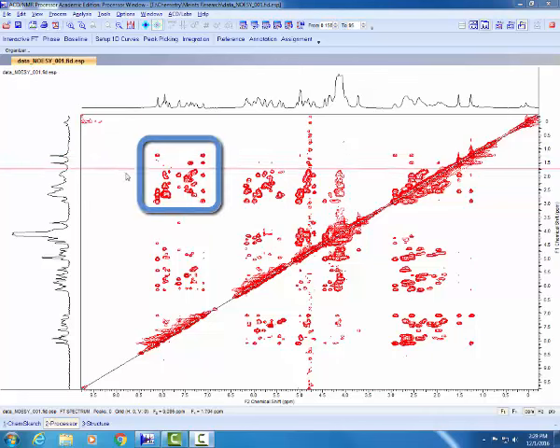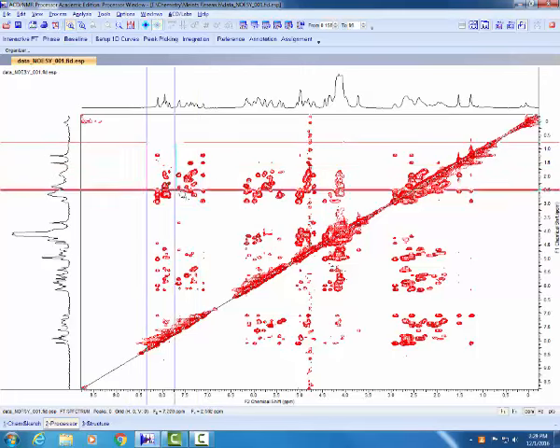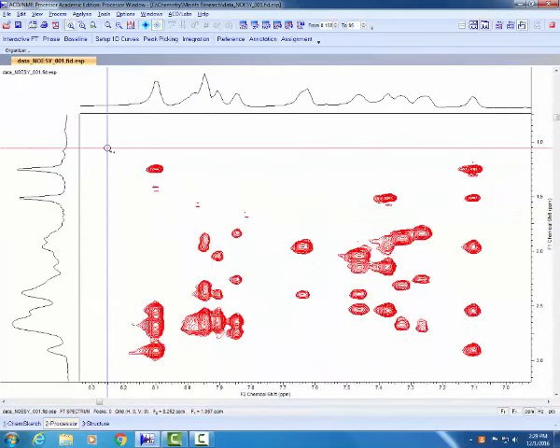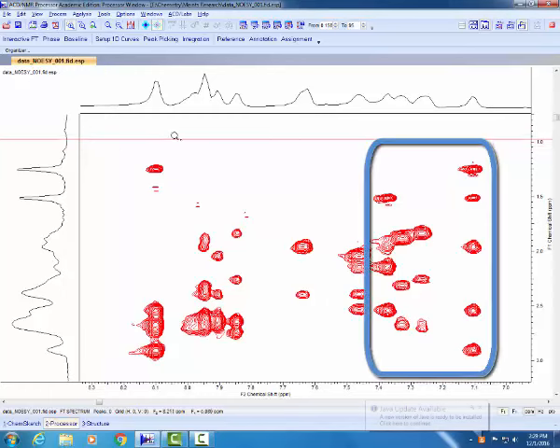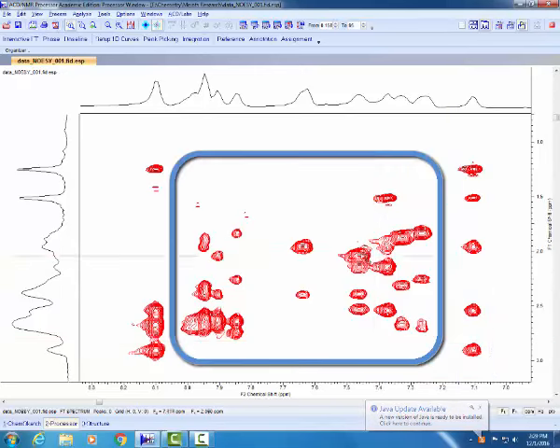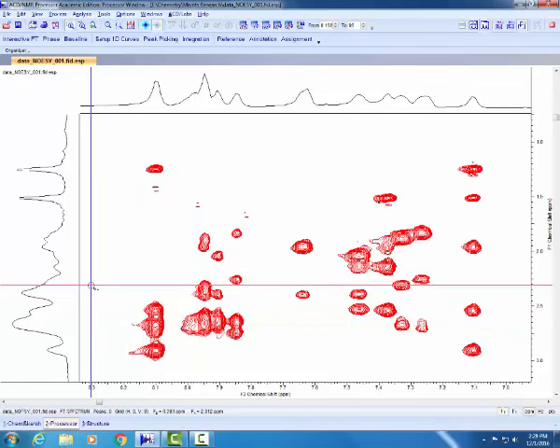On the spectrum, this area is in the top left and is known as the 2' to 2" region. So let's zoom in on that. In this region, and in the 1' region, the bases usually have the following shifts. Thymines on the right side, most upfield, C's and G's in the middle, between 7.1 and 7.8 ppm, and A's on the left side with the most downfield shift. Remember, we are looking for peaks in a cross area where we would expect to find the T7H6 and T8H6 base protons interacting with the T7 and T8 methyl group.